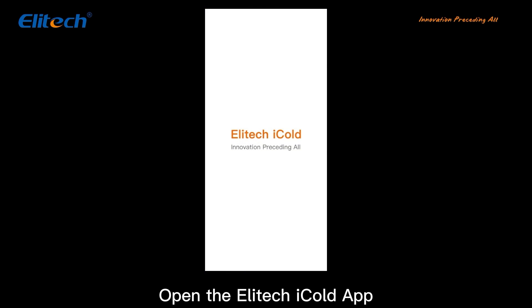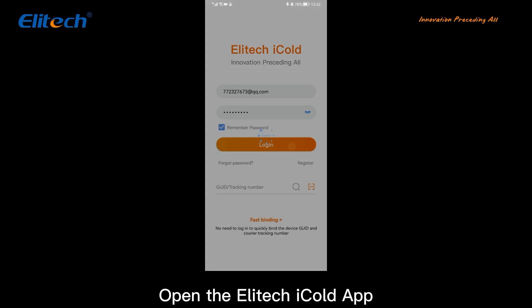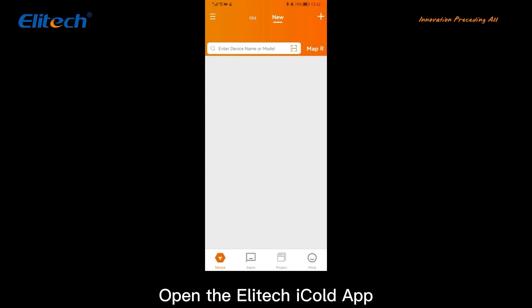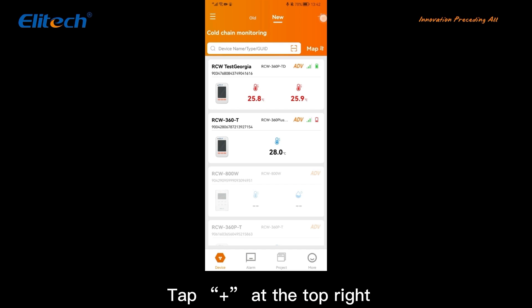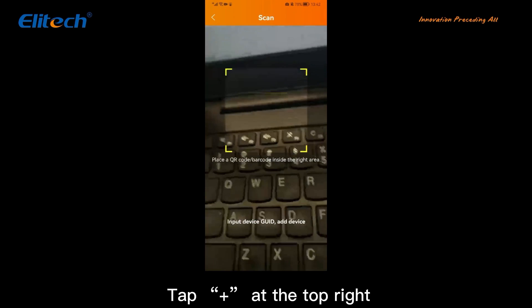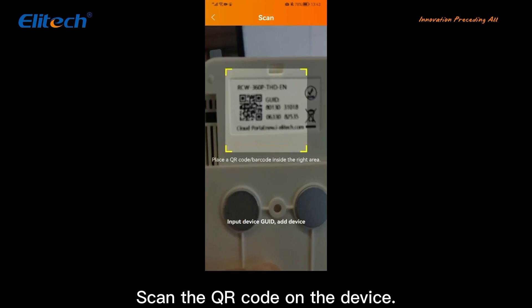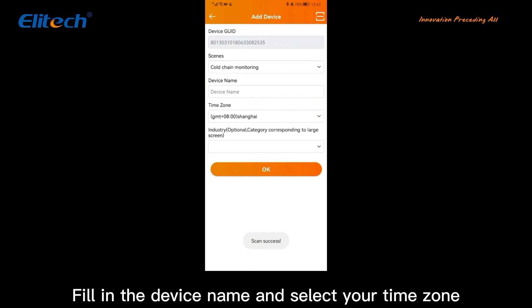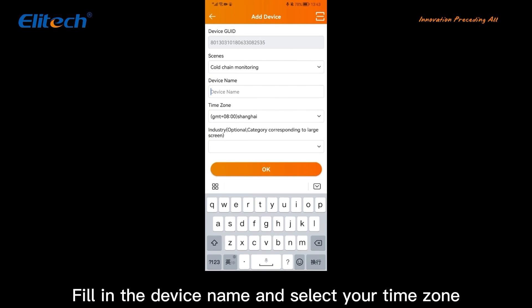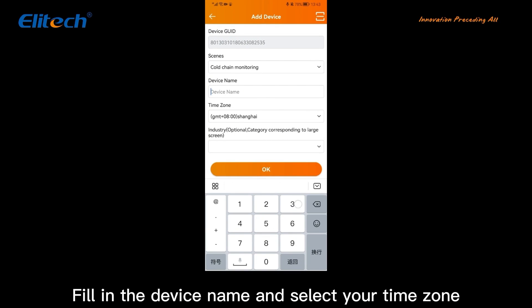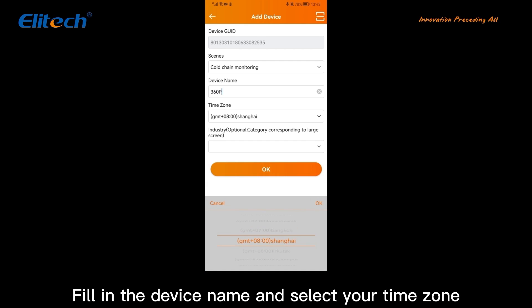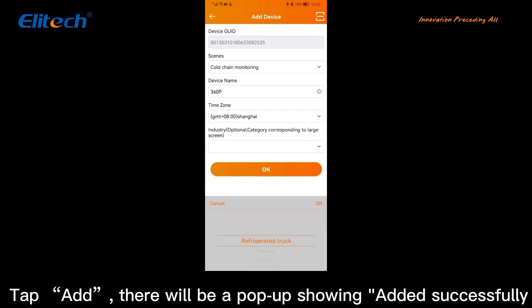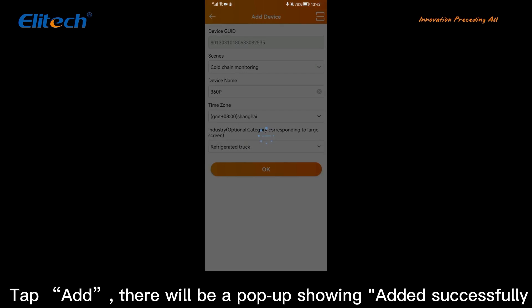Open the Elitech iCode app. Tap the Add icon at the top right. Scan the QR code on the device. Fill in the device name and select your timezone. Tap Add — there will be a popup showing 'Added successfully.'